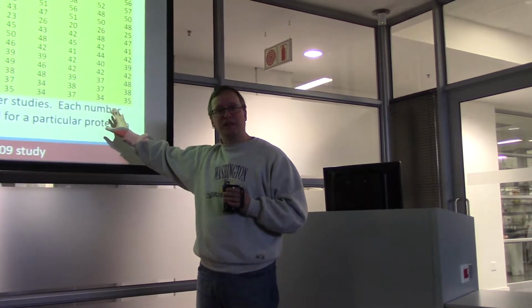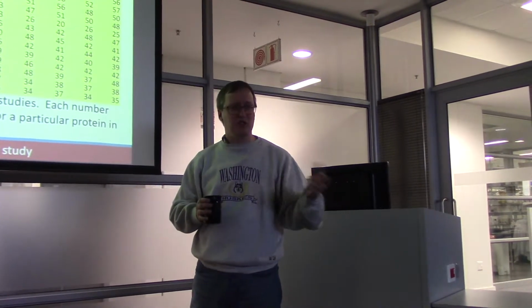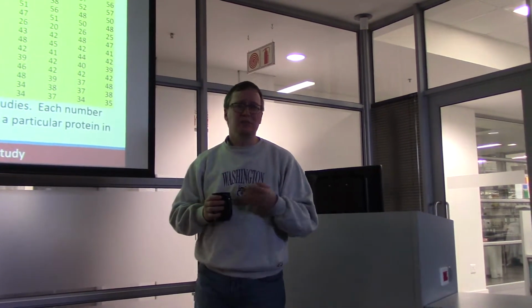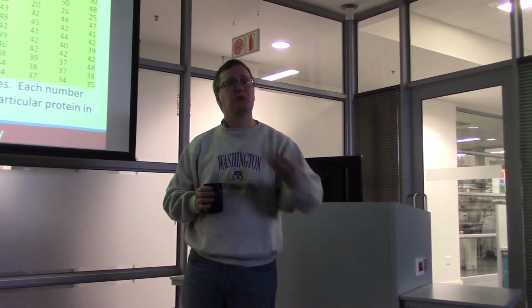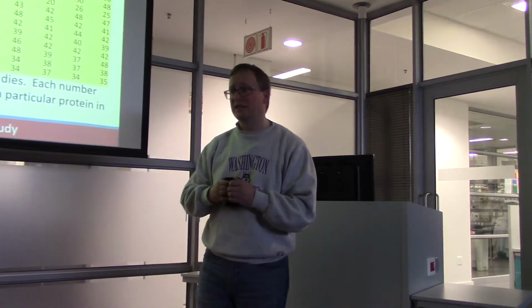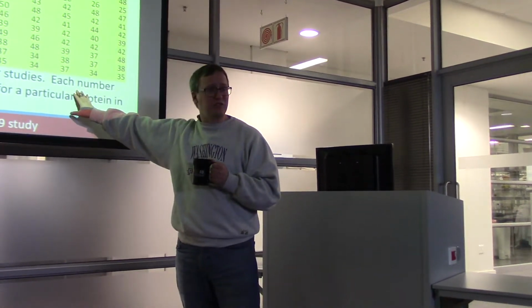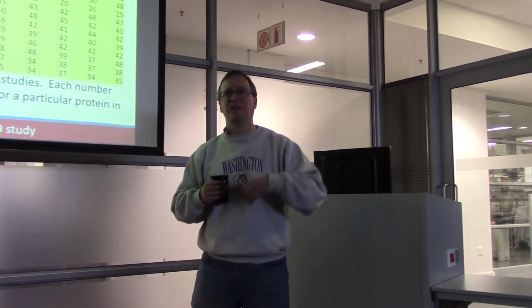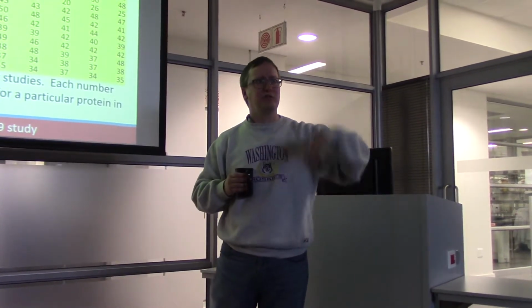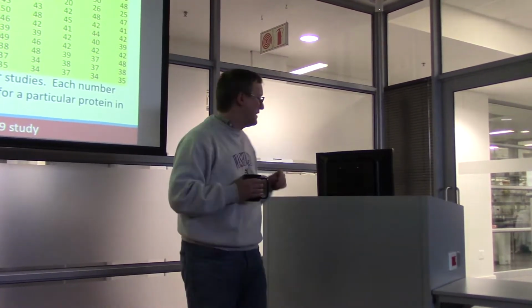How we deal with data of this sort to come away with decisions about which proteins are changing in concentration is something that a lot of people have taken some time with. There are lots of different statistical tests that have been created for this purpose. But because these are spectral counts, what we have are a bunch of integers to work with. These are counts, not values that are, say, normally distributed. They're generally more like Poisson distributed. It's kind of a mess.